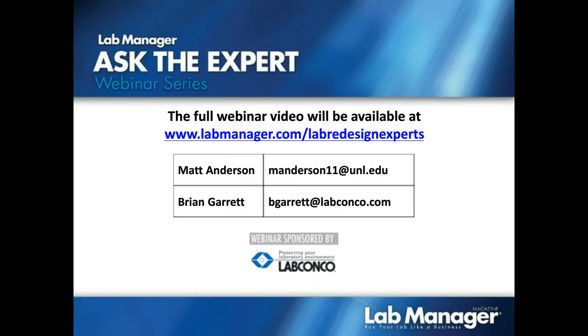Yeah, absolutely. And I'll definitely give Matt a chance to respond to this as well, since he was part of this team. The first step, and this is mostly coming from my lead accreditation, the first step is designing a team. So the lab manager needs to have either everyone in their lab, or the lab manager and the lab management assistant, or the lab manager and the biosafety officer, just a small team to go over all the procedures, from daily, weekly cleaning to actual sample manipulation, sample processing, sample acceptance, and then decontamination and removal. Go through all of that and determine what the risks are.